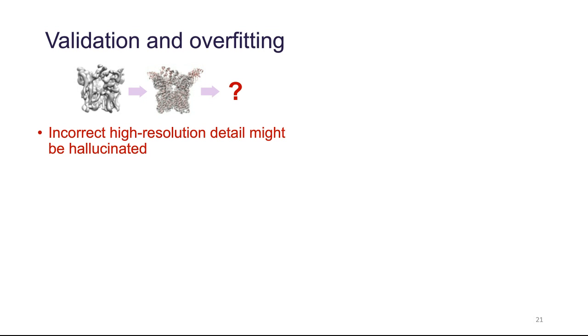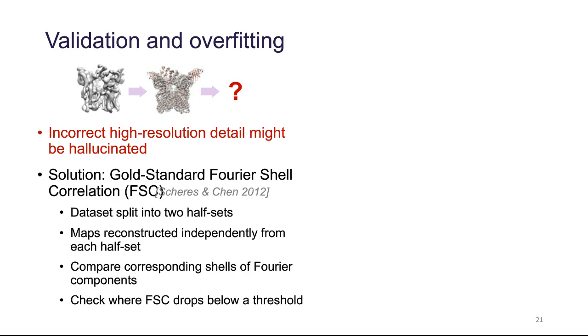In cryo-EM, overfitting and estimating the resolution of a reconstruction are closely related and have been somewhat hotly debated in the past, considered by some to still be open areas of development. Currently, one standard tool is the gold standard Fourier shell correlation, which provides a reasonably effective and objective measure of the reconstruction quality of a refinement. Measures like this are critical for real-life application in drug discovery, where decisions involving years and large investments may hinge on small details at near atomic resolution.